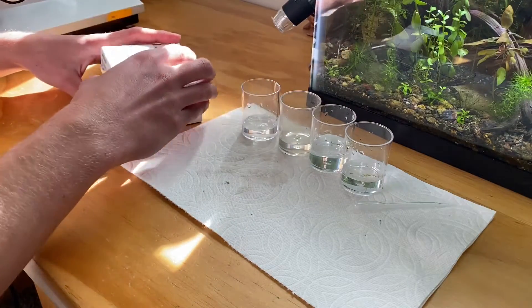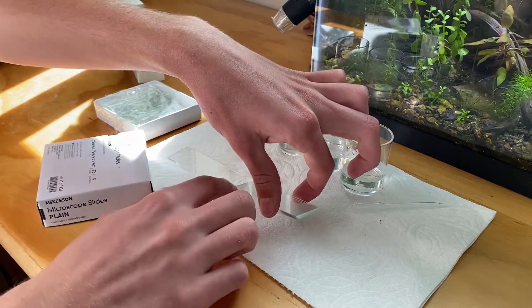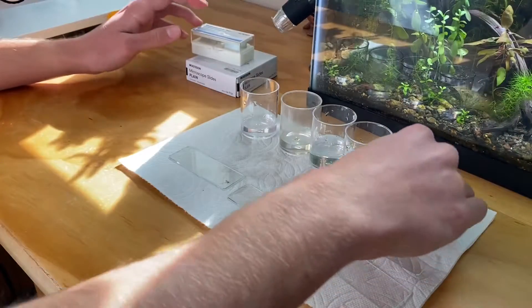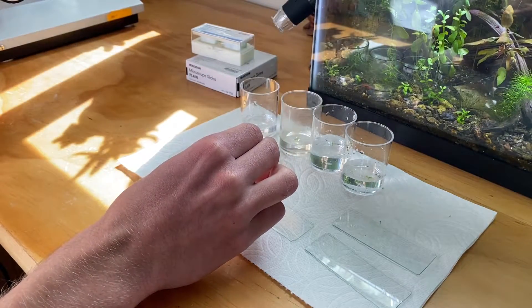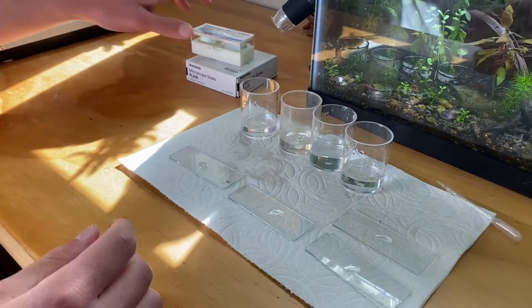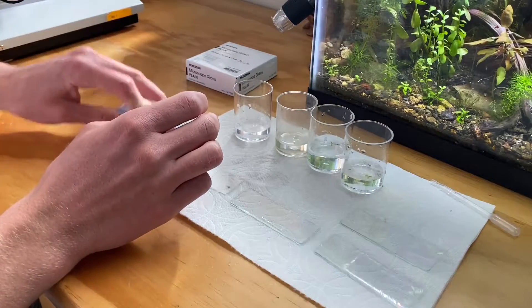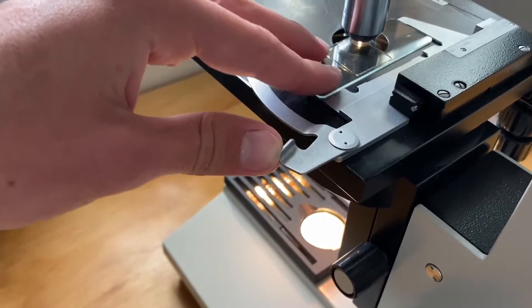So what I'm going to do is just get some microscope slides, I already have some picked out. Lay them out. Then get this little pipette right here, scoop some water up. So 40 gallon - probably only need like two drops, don't need too much. 5 gallon, 20 gallon, and the 5 gallon on my desk. Then we're going to get some cover slips. The slides are all ready to go. All we need to do is turn on the microscope, grab the slide, put it underneath, and take a look.